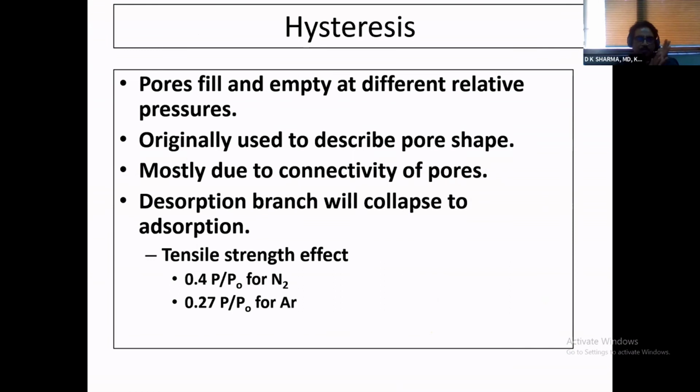Well, the desorption branch will collapse to the adsorption branch. It happens mostly due to the connectivity of pores, what you call interconnected pores.